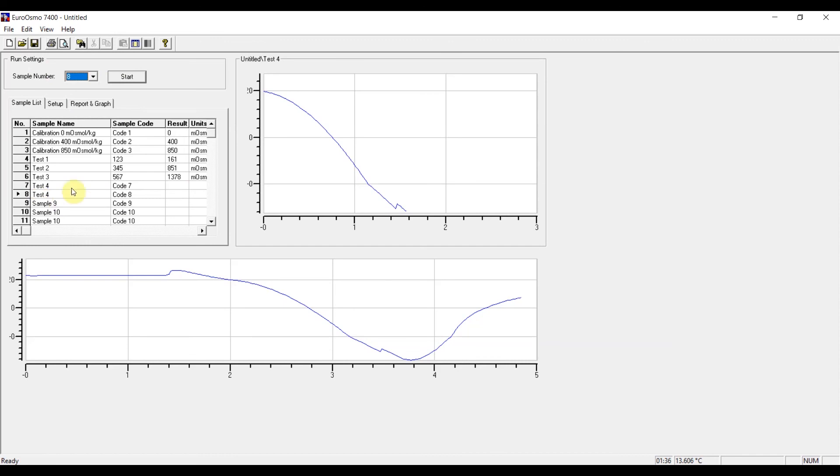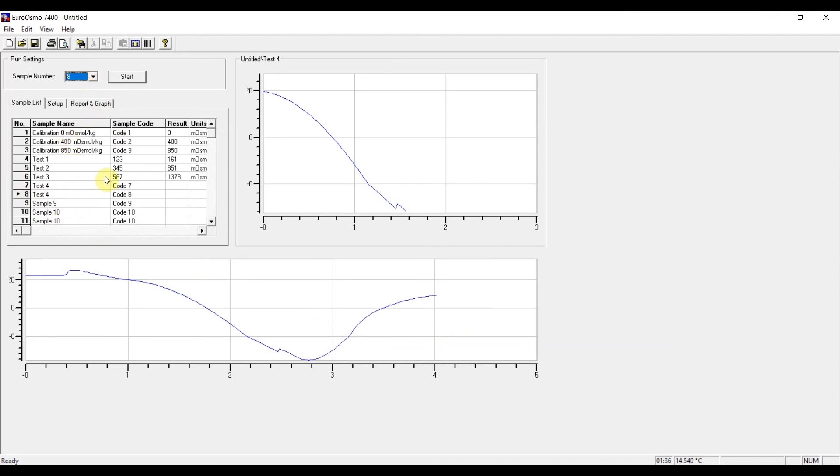If you do not wish to document the error, then you can just continue as before. So just leave everything as is, and then you just insert the new sample into the cooling cavity and just press start.